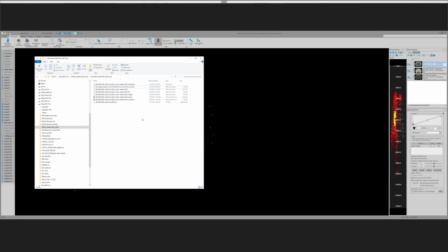You can do that and load that file into NeuroInfo, and then rather than go through the registration steps, we can just apply the transforms that have been done once. So this is extremely useful because that's the time-consuming part.